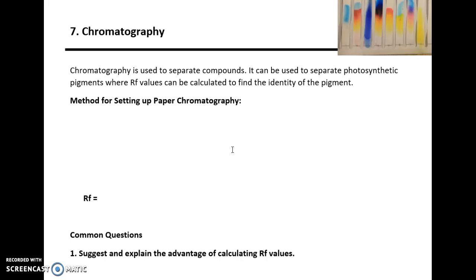Chromatography is a technique used to separate compounds. The context given in the specification was the separation of chlorophyll molecules from leaf, and then the RF value needed to be deduced so that could be compared to known values to work out the identity of the pigment.